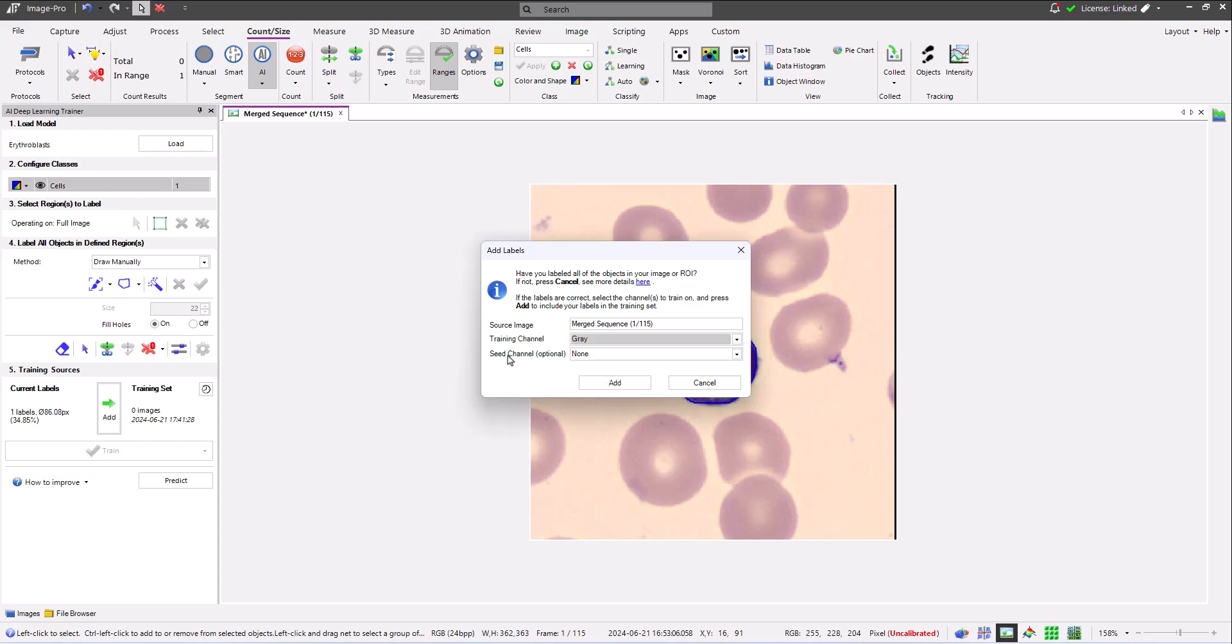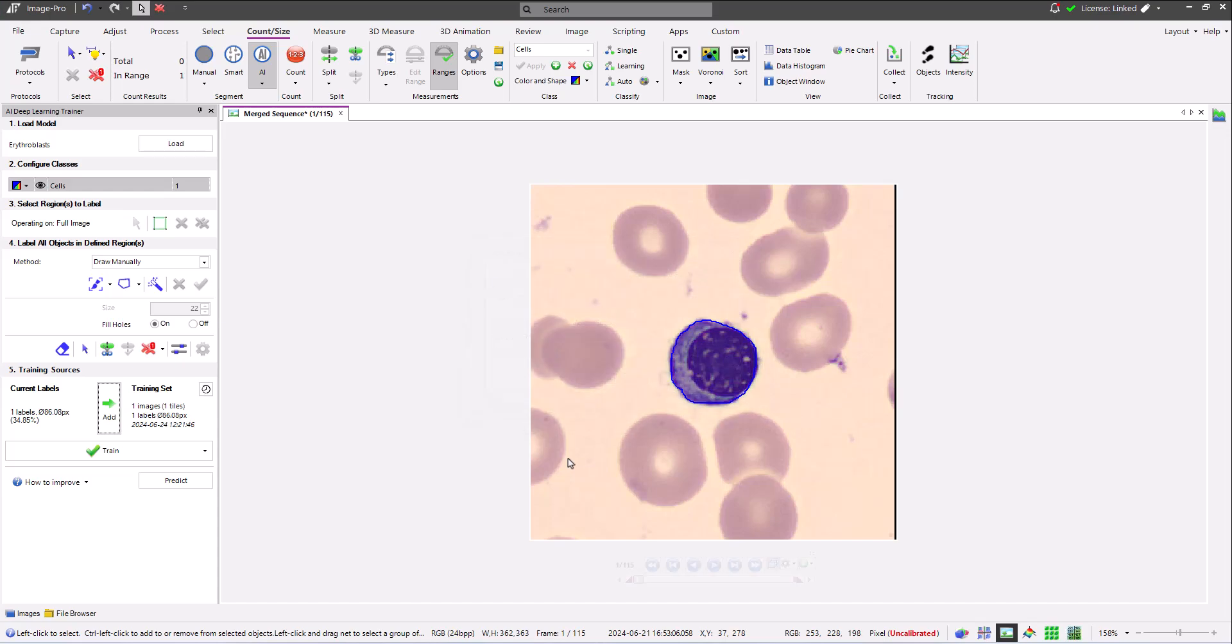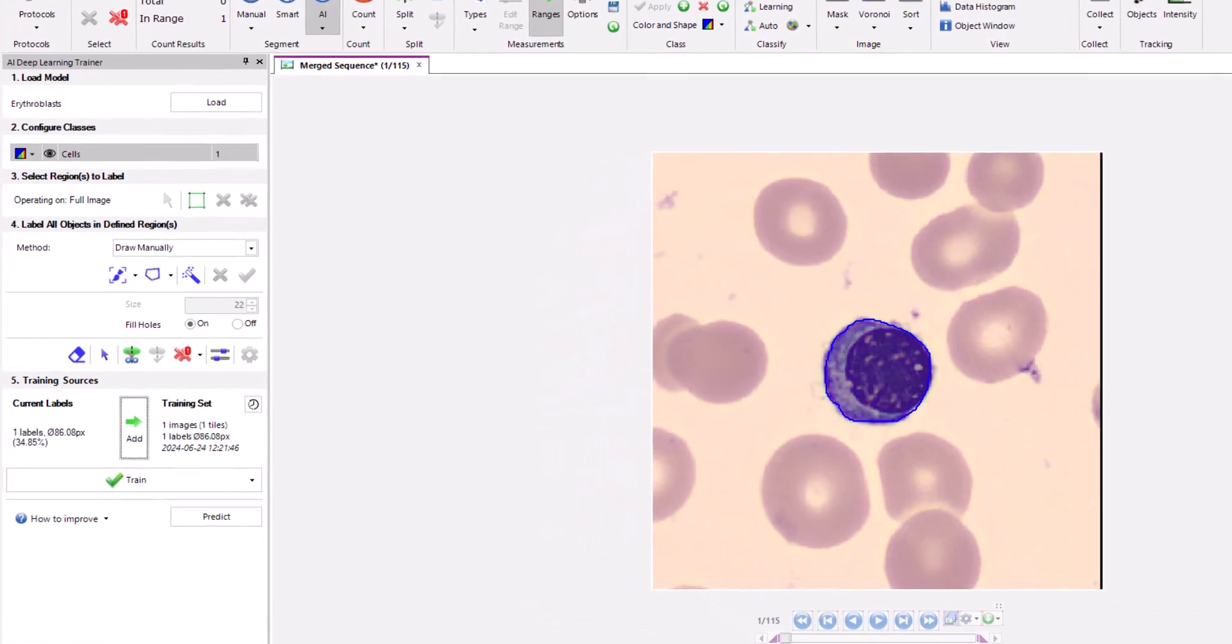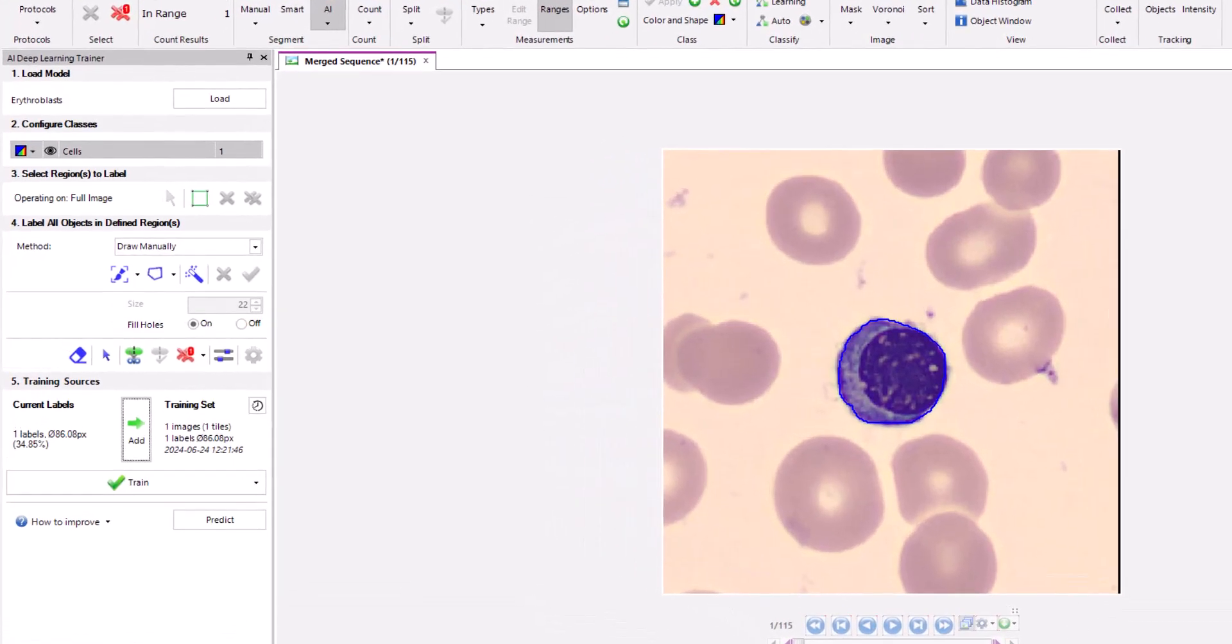The optional seed channel can be used to add context to objects. For example, the fluorescent cells model was trained with a training channel that contains stained cells and a seed channel that contains stained nuclei, helping the model to find cells with nuclei. In my case, with my color images, there is no channel to add context so I'll leave this optional channel set to none. After clicking add, my training set updates to show that it now contains one image and one label.